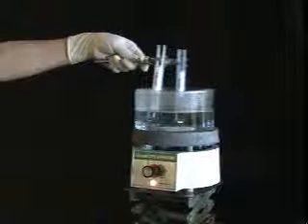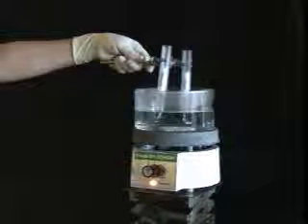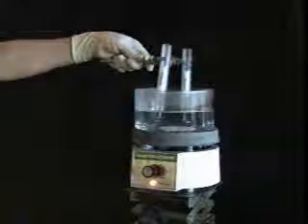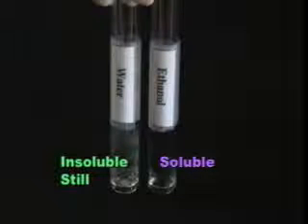If there is still solid remaining, clamp the tube and heat it in the water bath until the solvent boils. Swirl the tube and make note of whether or not the compound dissolves. After heating, naphthalene is still insoluble in water, but it is now soluble in hot ethanol. Now that you have finished the solubility tests, how do you decide which solvent to use for your recrystallization?